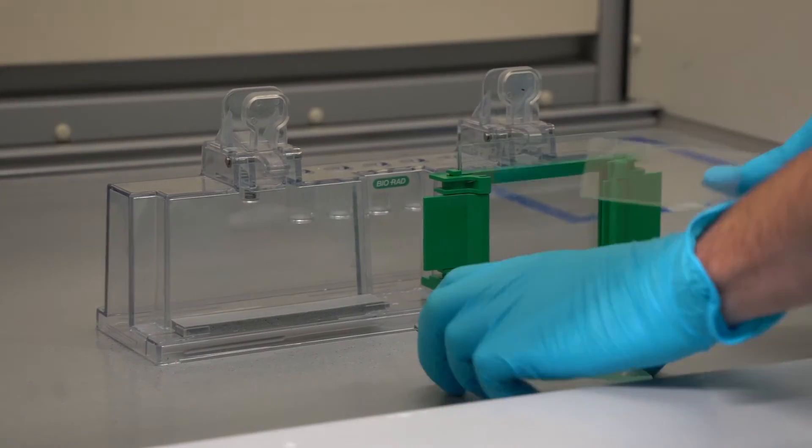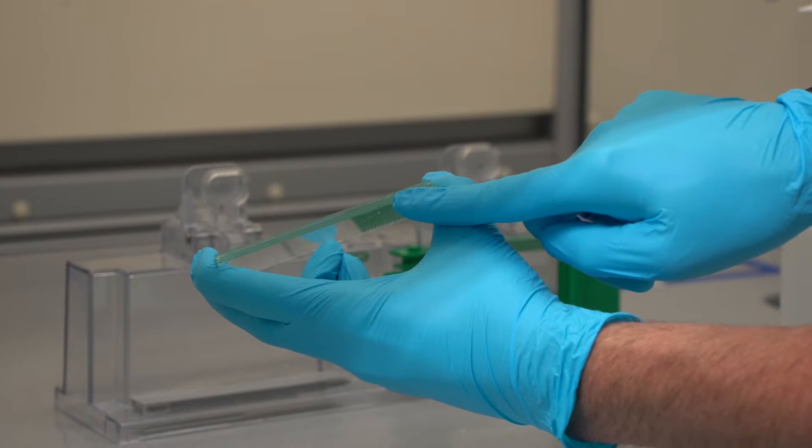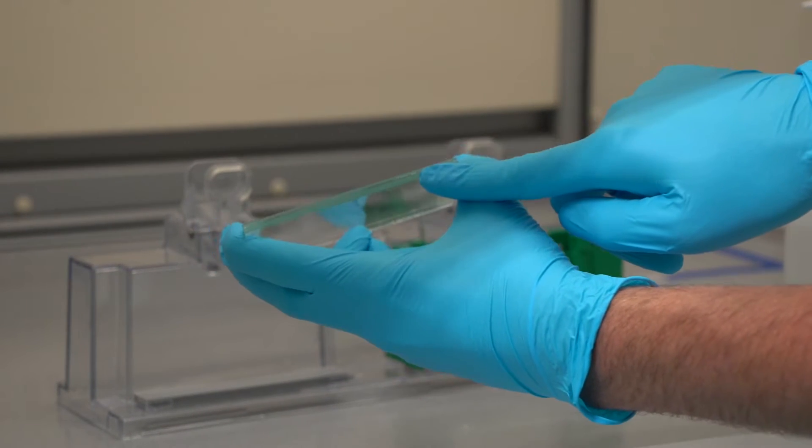Place the clean short plate on the spacers of the clean spacer plate so there is an opening between the two glass slides. This is where the gel will be poured.